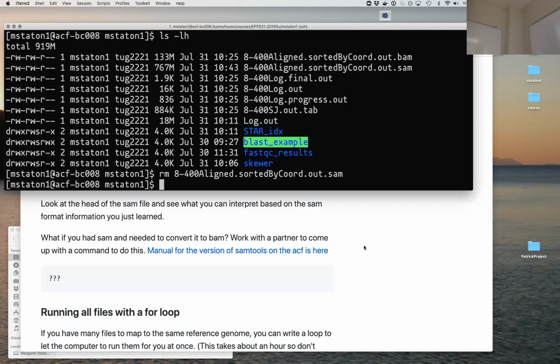So both of those are binary formatted. SAM is a text file. So I'm looking at that, but you said extra credit. The two files are binary. They both convert back to the exact same SAM. Smaller size, you create the BAM samples of STAR. I'm guessing it's something different between STAR and how it does it.